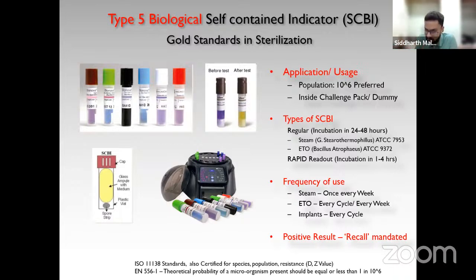As for the minimum time that an Indian sterilizer needs to give, given the conditions in India, given that we don't provide chiller water, given that our water may not be RO, we always suggest that instead of blindly following any of the cycle parameters, you should test your autoclave to see whether the indicator is passing at 15 minutes. If it is not passing, increase the time to 20 minutes. If it is not passing at 20 minutes, make it 25 minutes. That means when your indicator is able to pass at 121 degrees Celsius in 20 or 25 minutes, that should be your benchmark for doing the cycles. And that is how you should set the cycles.